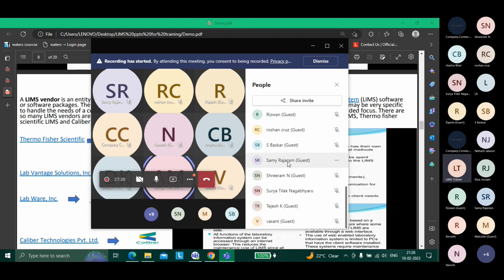In version 6, you will see the ribbon is green. Version 7 to 8, if you notice, it will be somewhat bluish. There will be changes. Workflow icons, workflow menus will change, things will get faster. But some basic table structures, some basics, they won't change, I believe.